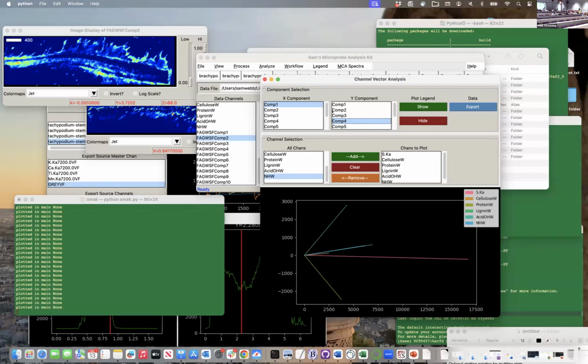And some of these things have simple autofluorescence, right? So we didn't have to treat the sample. We just took an image to guide ourselves before we go to the infrared, so that we actually get what they were sending us, with the images somehow matching for certain depositions.